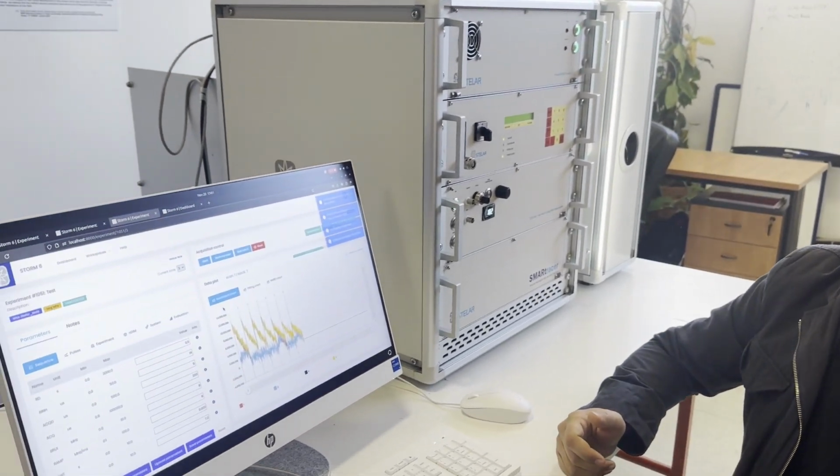Thank you. So at Stelar, we are committed to provide you instruments to perform NMR experiments for all kinds of users, from basic experiments to researchers. And we are committed to provide you the best tools which will be really helpful and useful for your experiments.